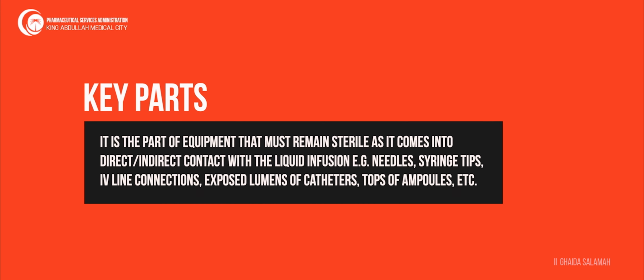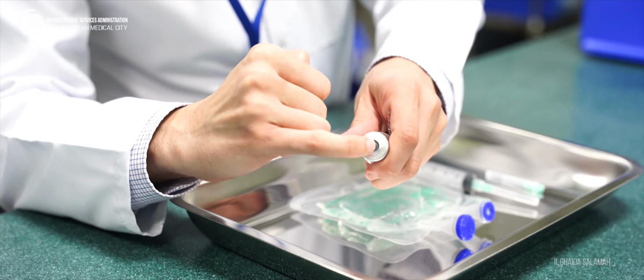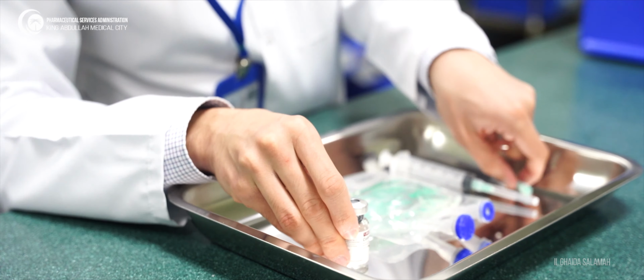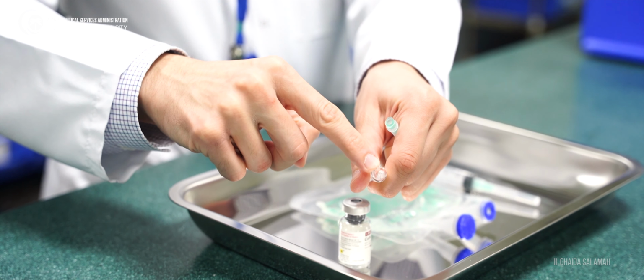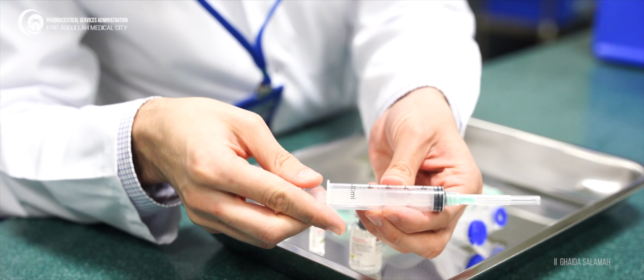Key parts. It's a part of equipment that must remain sterile as it comes into direct or indirect contact with the liquid infusion. For the vial, the key part is the septum, which is the rubber component of the vial. For the ampule, the neck part is the key part. For the needle, all parts of the needle are key parts.